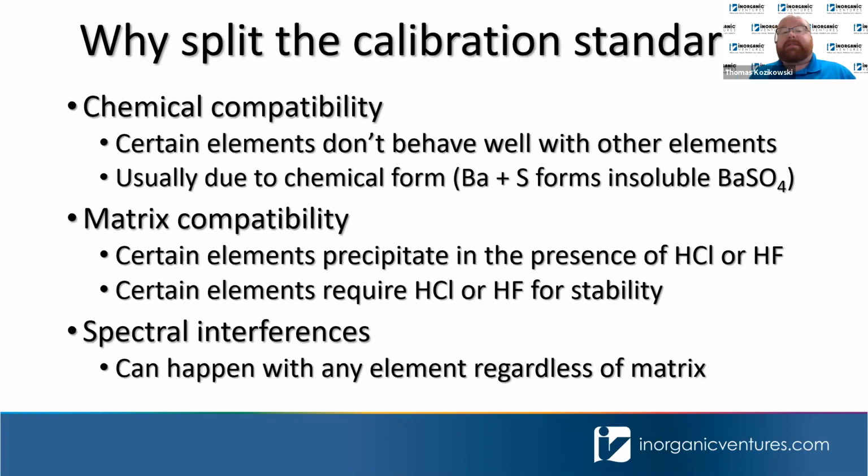The next is matrix compatibility. Some elements precipitate in the presence of HCl or HF, but as you all know, certain elements require HCl or HF in order to remain stable. So we wanted to split those up in order to satisfy matrix requirements.